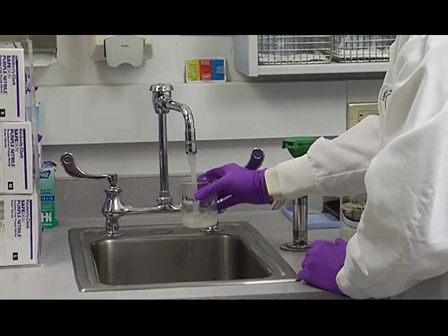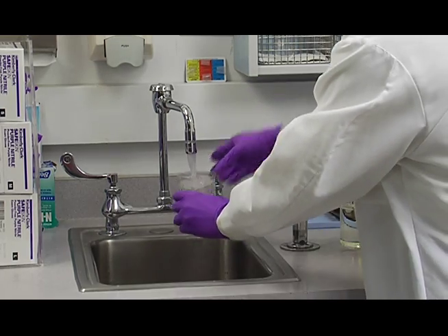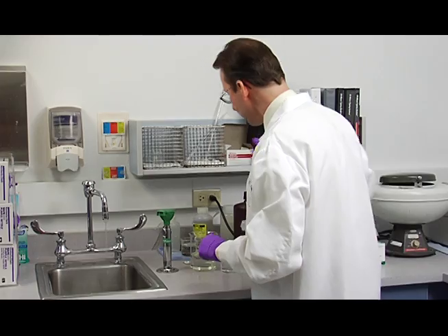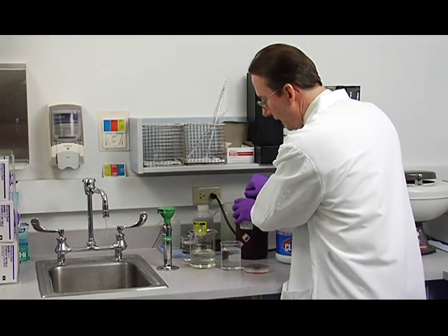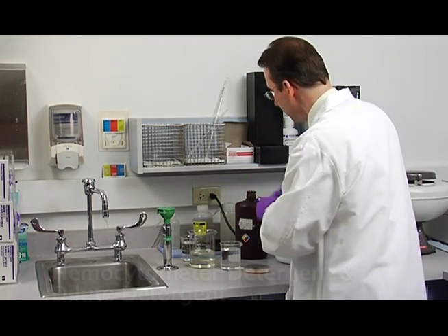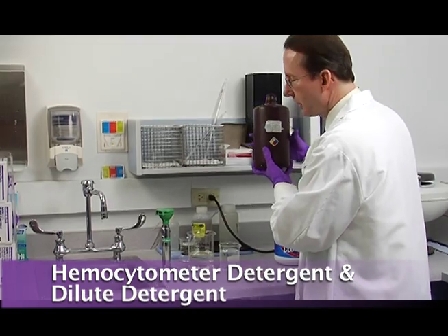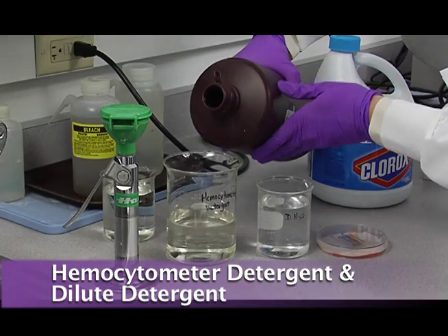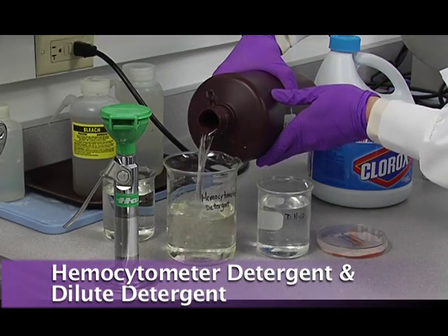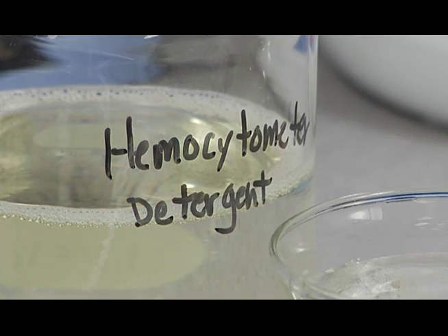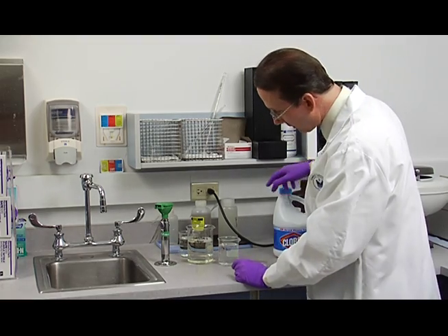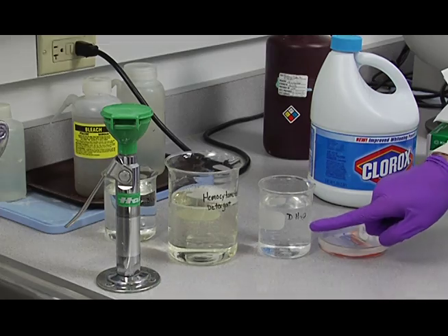We'll be using this later after we've completed the counts. So then this is the hemocytometer detergent. That needs to be about half full, and this is a dilute detergent that we use for cleaning the hemocytometers. And then you'll need a beaker about three-quarters full of deionized water.